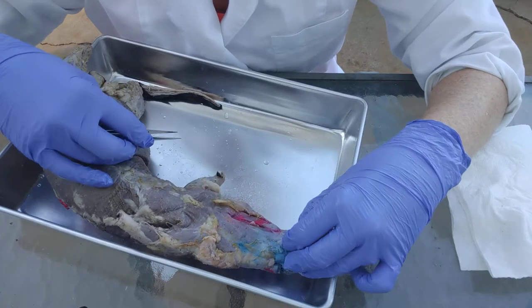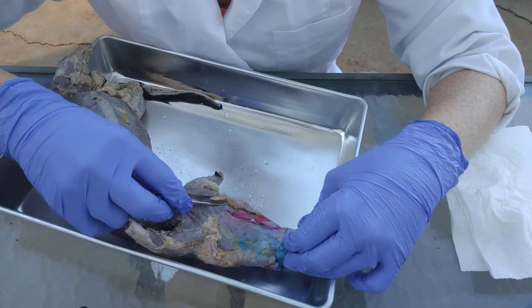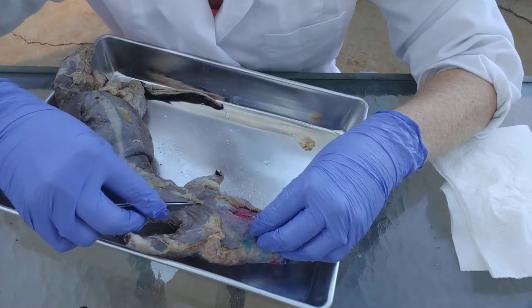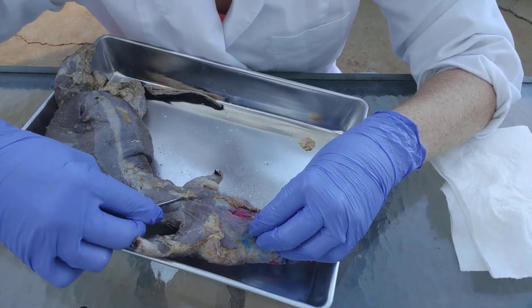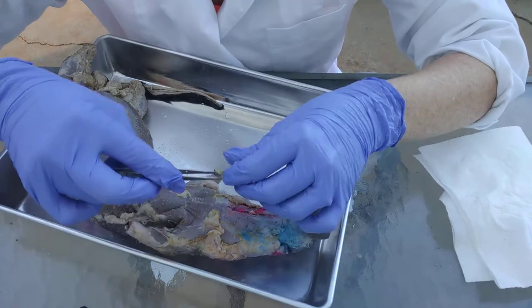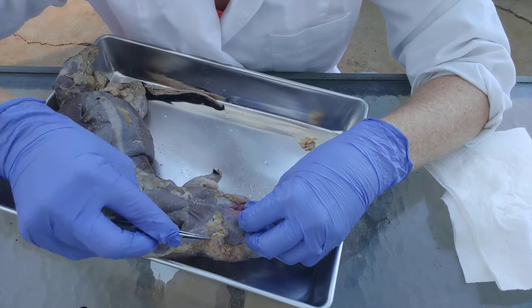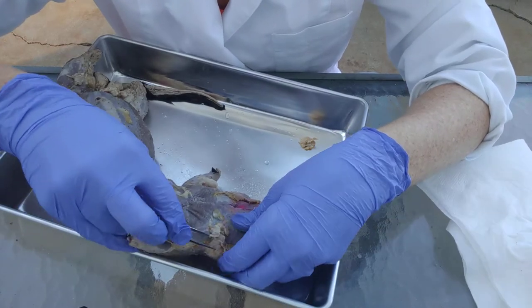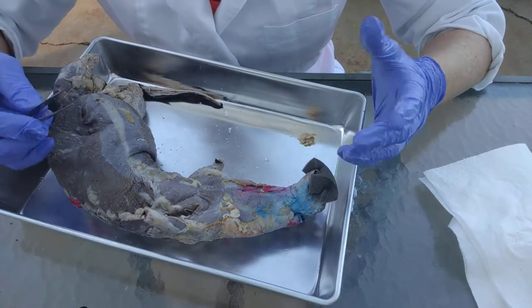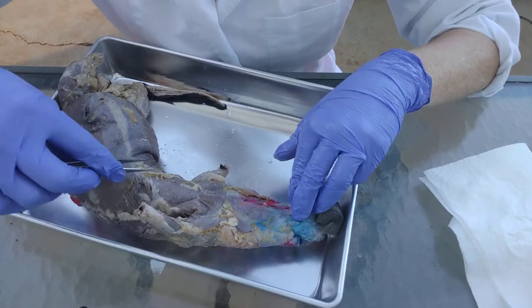The very first thing you need to do before you can start on the muscles is to remove all of the fat tissue and all the loose areolar connective tissue from the surface, and then to break through all of the fascia, which is the epimysium — the connective tissue that surrounds and protects those skeletal muscles. The good news is that the mink has fairly low fat, especially compared to cats, so that shouldn't be too hard.